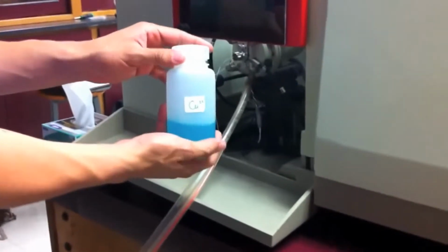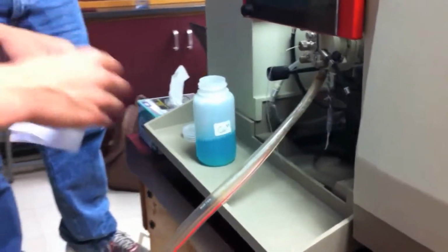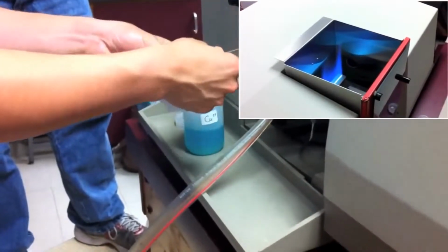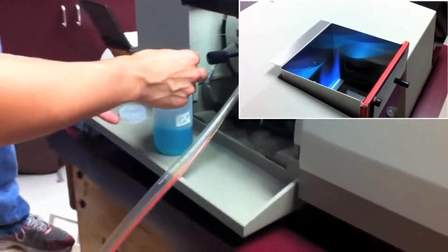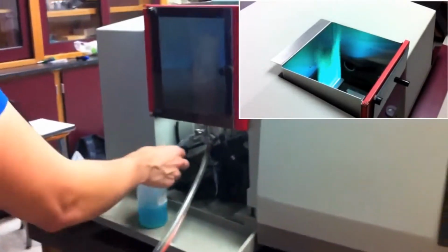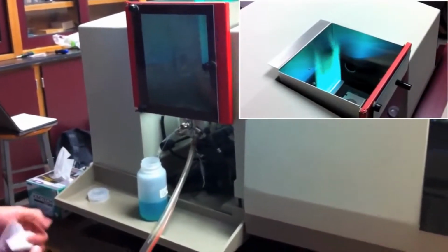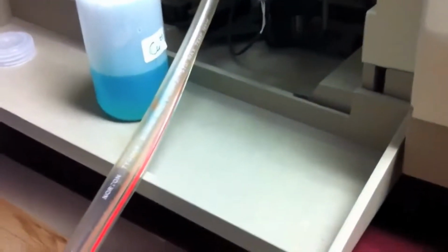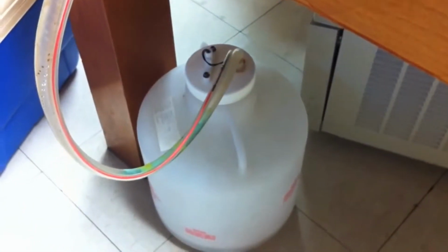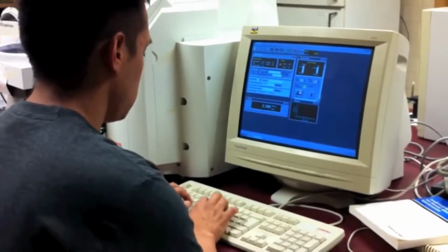This demonstration will use a sample of copper. First, start by cleaning the sample capillary with a chem wipe. Then, insert it back into the sample to be aerosolized, mixed with gases, and released into the flame. The flame turns a green color that is distinctive of copper. Waste is then siphoned off into a collection bucket. The data is then sent to the computer for analysis.